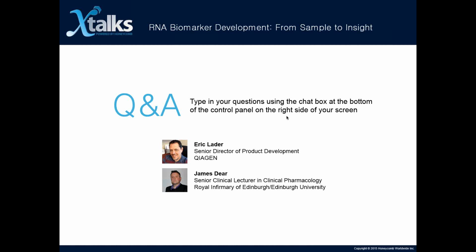The other thing, though, is if you're looking to develop this as a biomarker, I imagine you want to do it quickly. And the methodologies that you need to do library construction and then sequencing deep enough to read everything will take a couple of days longer than if you just did it by PCR. I think PCR is much easier for high throughput, standardization and automation than sequencing at this point.